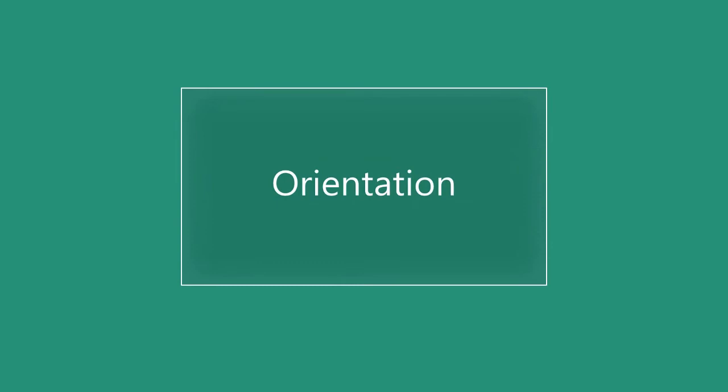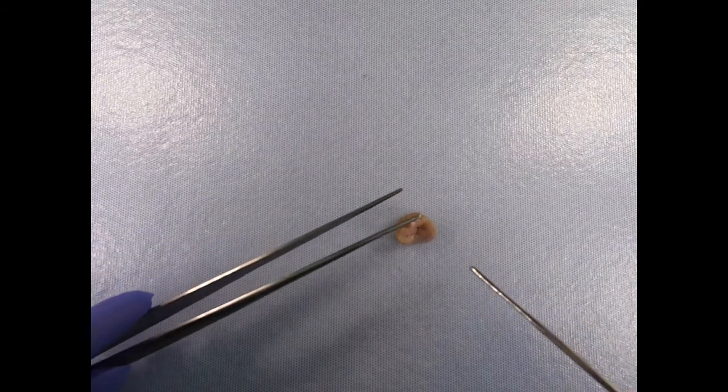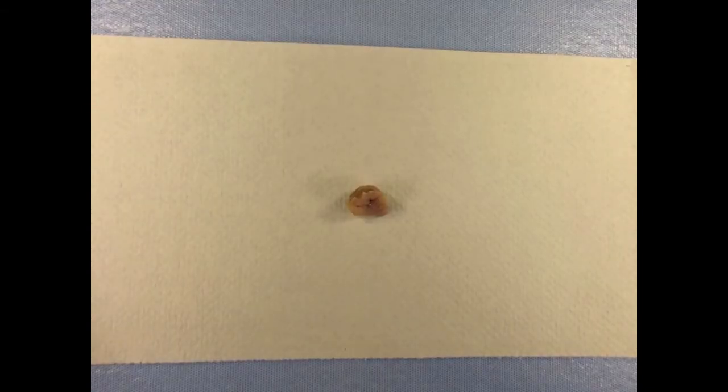Orientation. Large loop excision of the transformation zone specimens, or LLETZ specimens, are often rectangular in shape with a central defect representing the external os. They may be received oriented or unoriented.